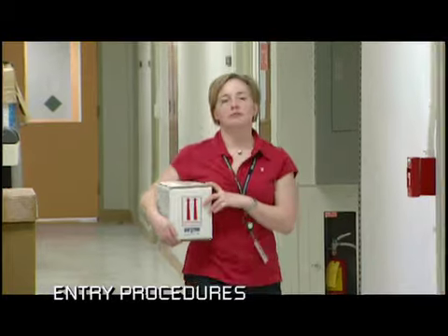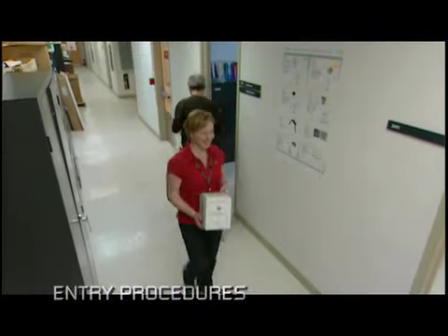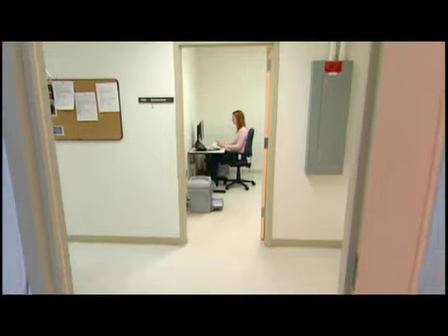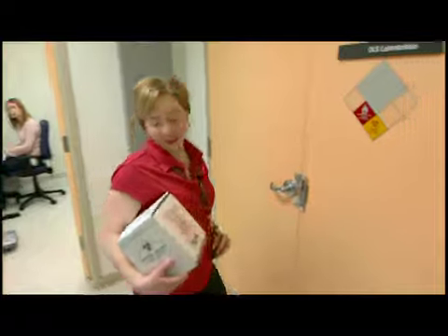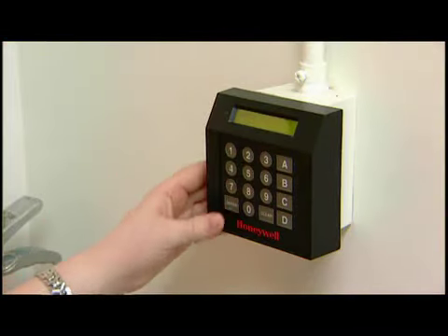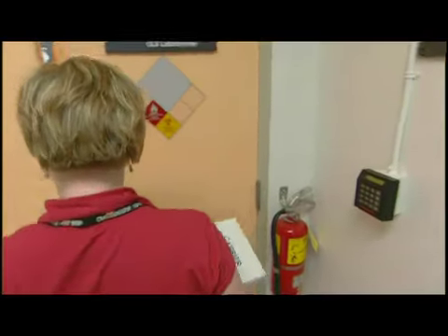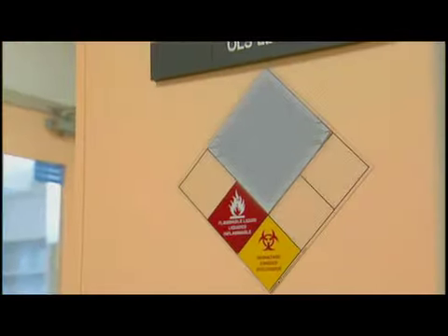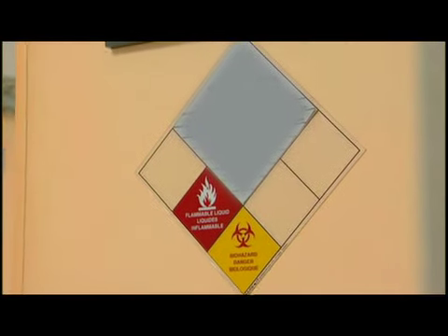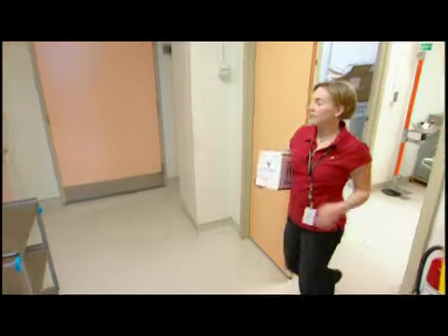In this Containment Level 3 lab, as in many facilities, you access the lab from a main corridor that connects to offices and other labs with lower containment levels. The containment laboratories are separated from all public areas, limiting access to authorized personnel only. Notice that all office areas are outside the containment area itself. Signage also identifies what hazardous materials are being used in the facility and who to contact in case of an emergency.